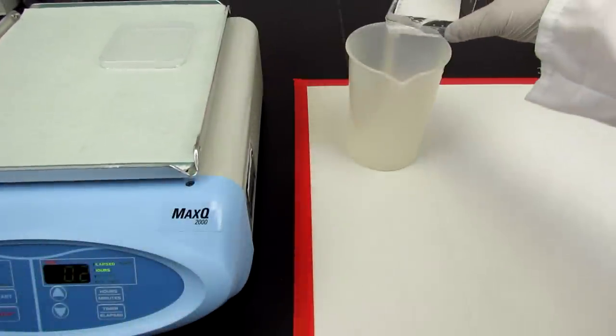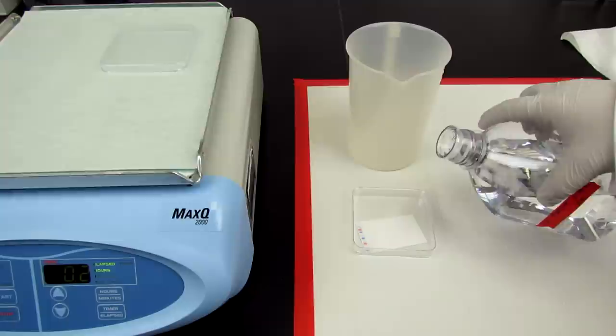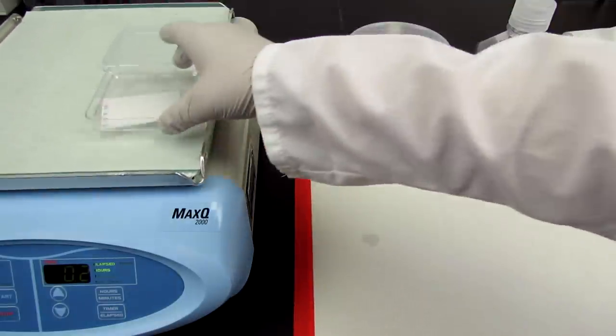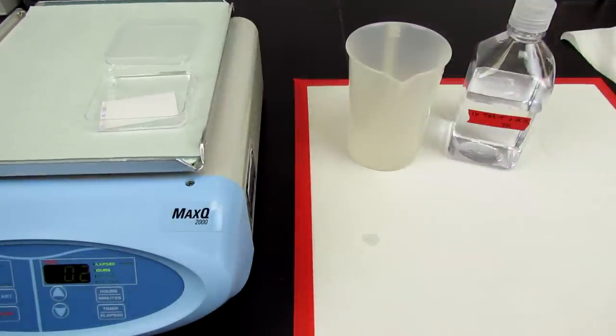After blocking is completed, wash the membrane three times with a wash buffer such as TBST or PBST alone, and the blocked membrane will then be ready to be probed for your proteins of interest.